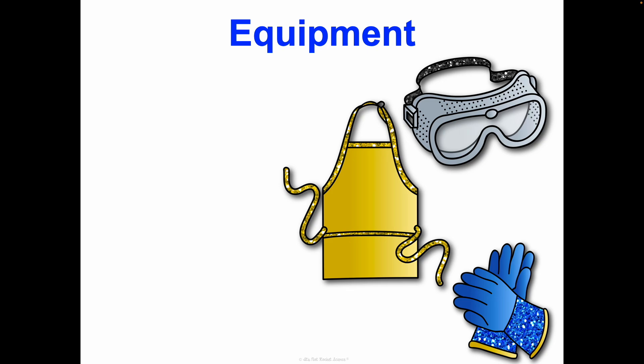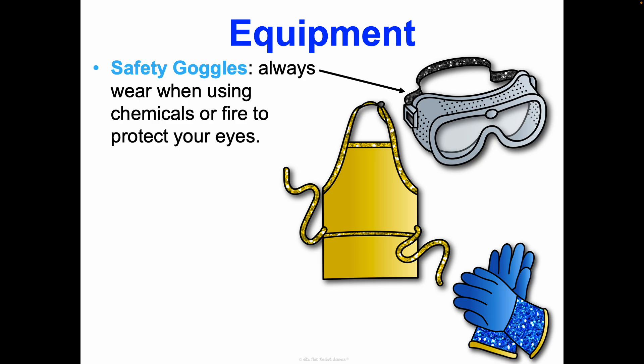Let's talk about some important safety equipment you'll need in different scenarios. Safety goggles — we're always going to wear these when using chemicals or when there's fire; that protects your eyes. I know you don't want the marks on your face, but it's going to be more embarrassing if you have to use the safety eyewash and your whole face gets soaking wet. So wear your safety goggles, and these stay on even when we're cleaning up. We don't take them off until you're back at your desk with not a chemical in sight.